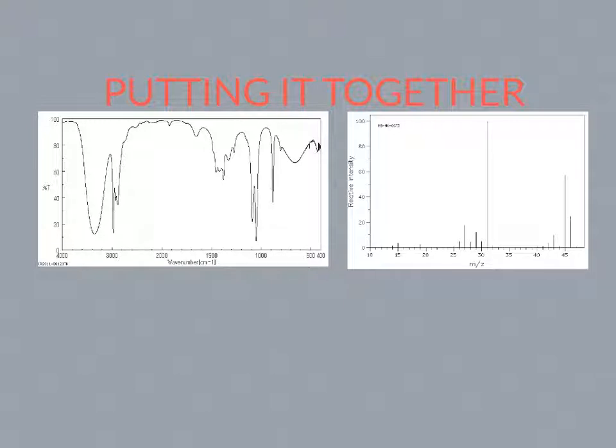The next thing we will do is try and understand our formula. So, going back to IR, we have an alcohol. We know alcohols have an OH bond, so we have an oxygen and a hydrogen, absolutely. We also have carbon to hydrogen single bonds, sp3 bonds, as we noted here. So with knowing that, we know we have carbons, hydrogens, and an oxygen, possibly more.